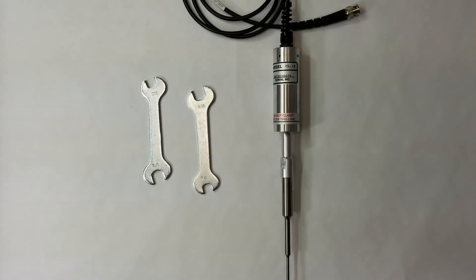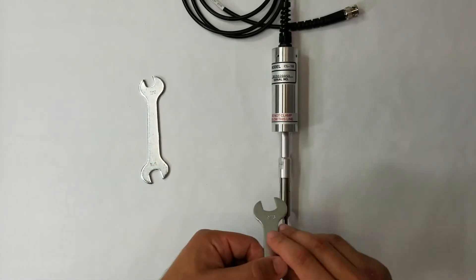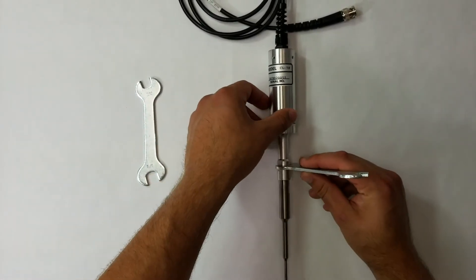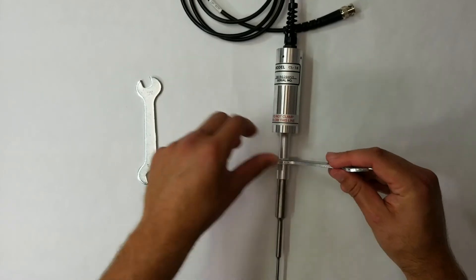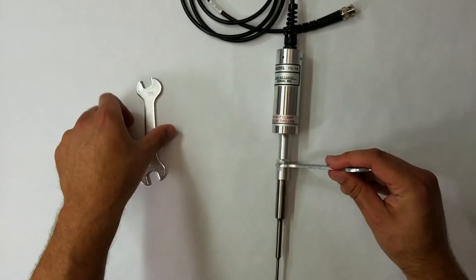To disassemble your ultrasonic probe from your converter, take one of the wrenches and place the 9-sixteenths end on the wrench flats of the converter.